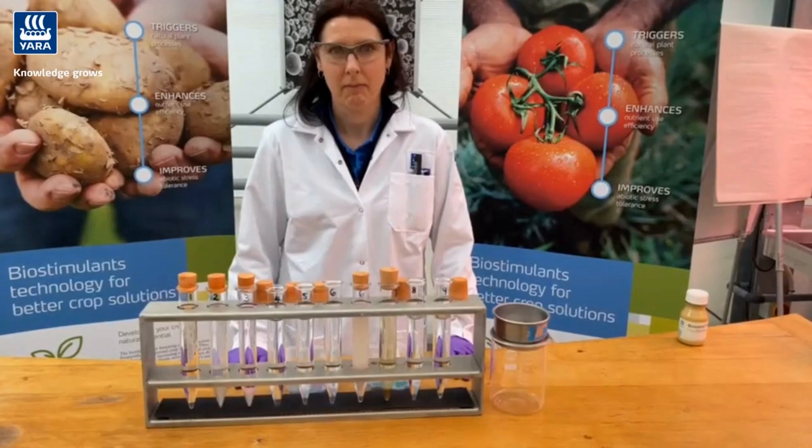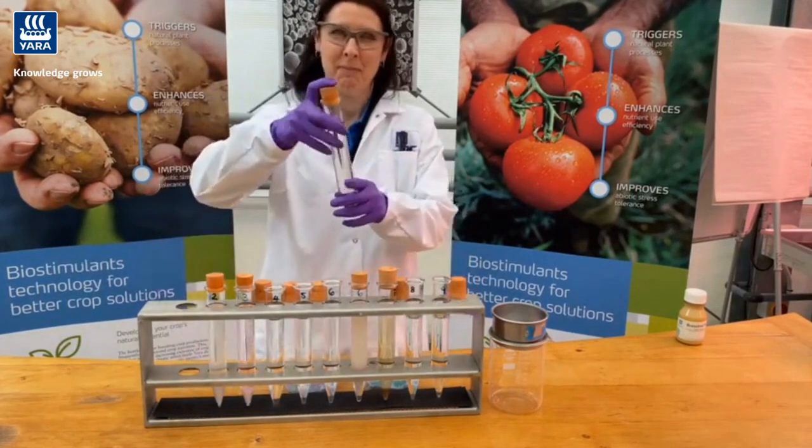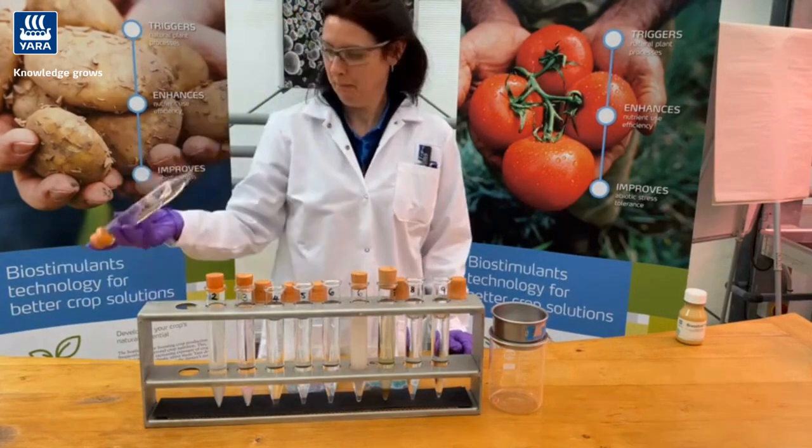So here we have a number of test tubes with various mixtures. The first tube is that C. It's that physically compatible mixture, as you can see there, very, very clear.